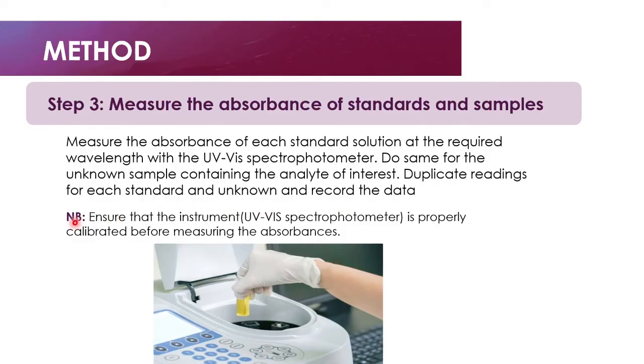Before we use the UV-Vis spectrophotometer, we must ensure that it is well calibrated before measuring the absorbance. And we normally use the standard to calibrate the spectrophotometer.